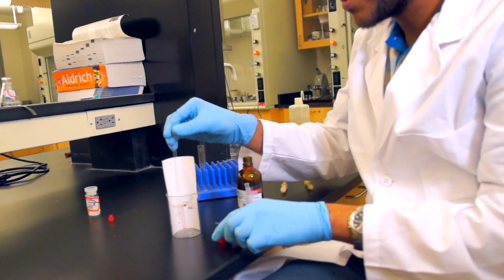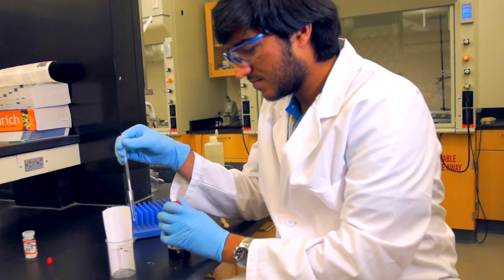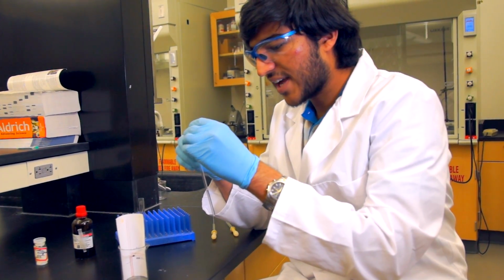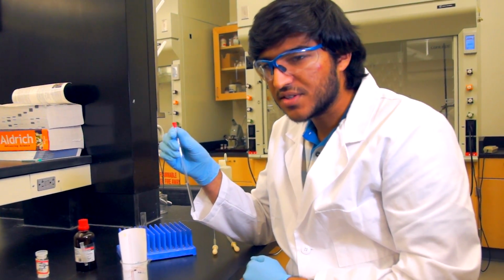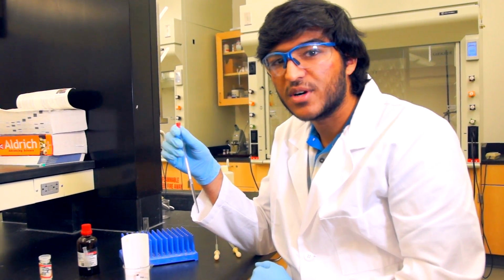Now that I have the right amount of solvent, I can cap the bottle and cap my NMR tube. Make sure you put the cap on straight, because if it's not, as the NMR tube spins in the NMR, it could offset your results. Now let's go upstairs and see how to load the NMR tube into the NMR machine.